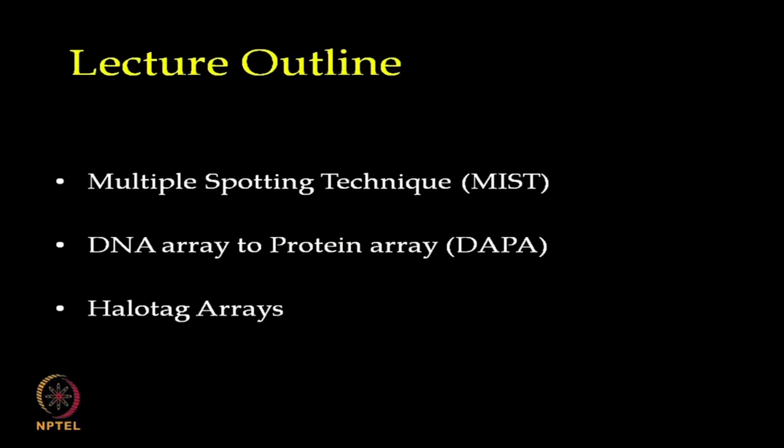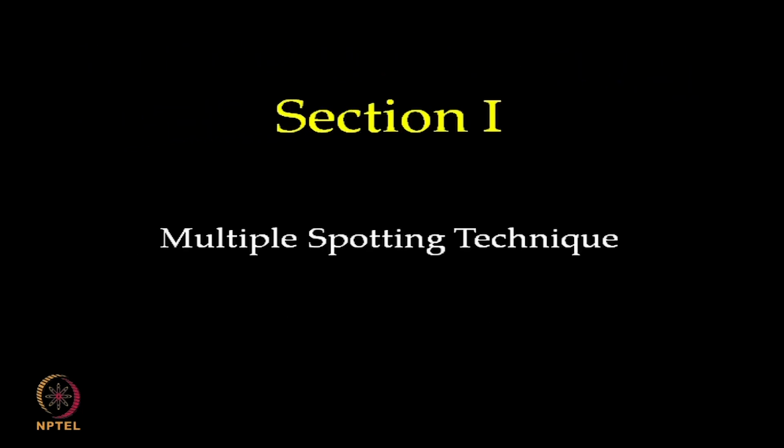In our previous lecture, we discussed two cell-free expression protein microarrays, namely protein in situ arrays and nucleic acid programmable protein arrays, PISA and NAPA. Today we will talk about the multiple spotting technique.